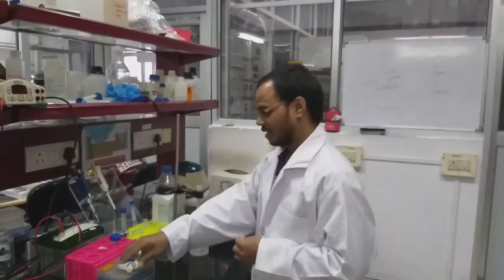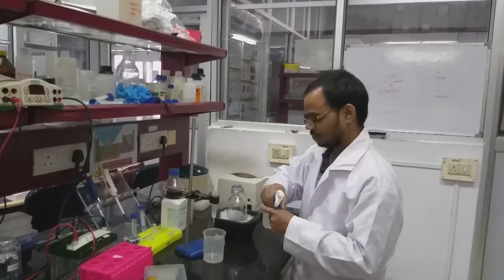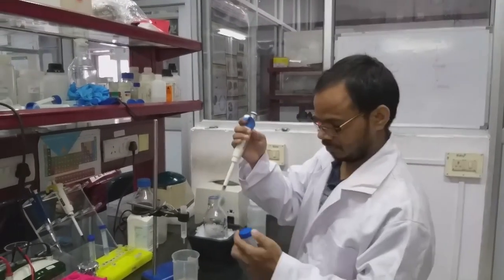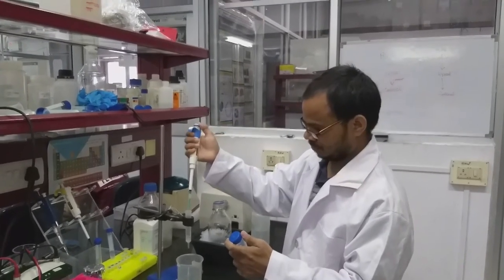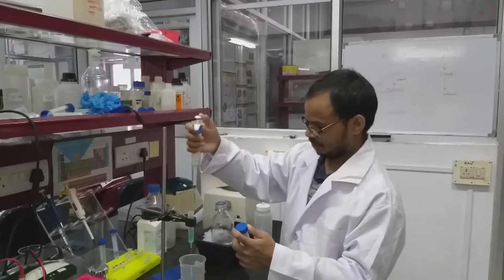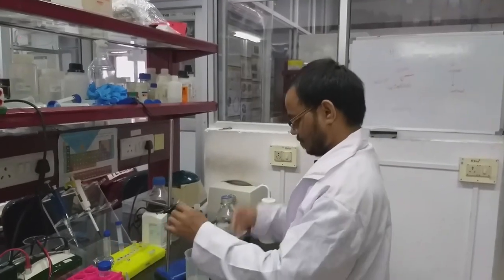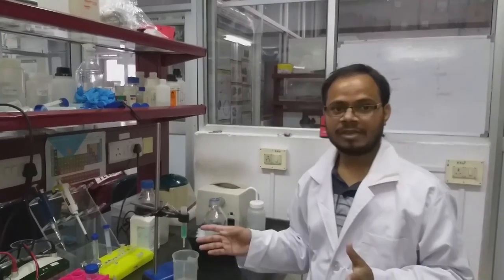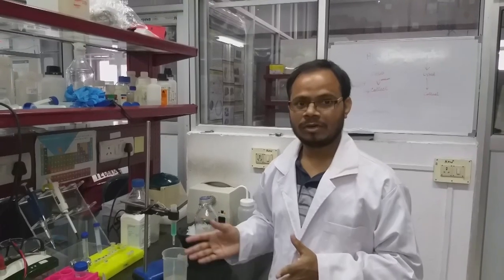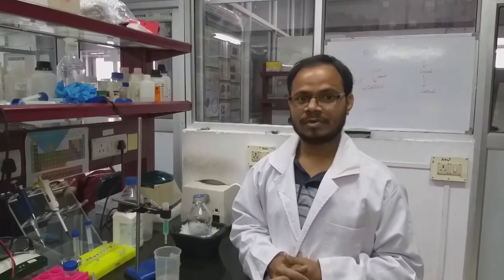So now we will equilibrate. This is a nickel chloride solution. We will keep it in this condition for at least 20 minutes to charge the beads. After that, we will elute the nickel solution and then equilibrate with the lysis buffer.